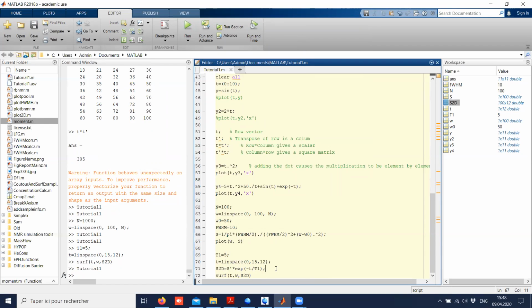Vectors together to create a matrix, and each column of the matrix contains a spectrum. I have another question now.